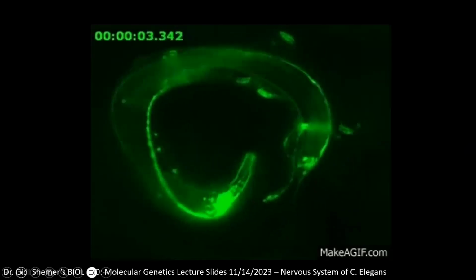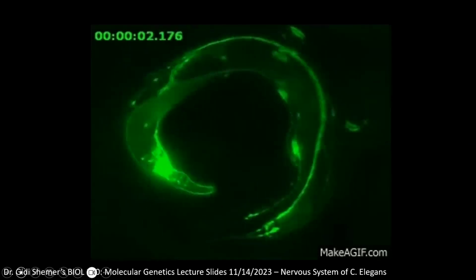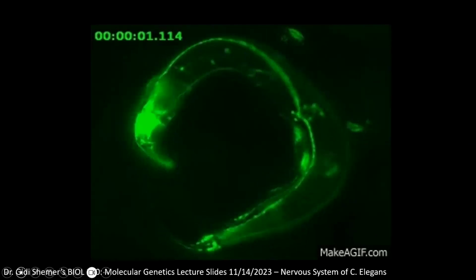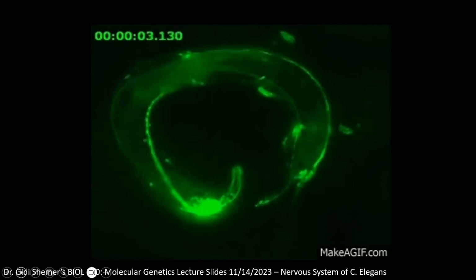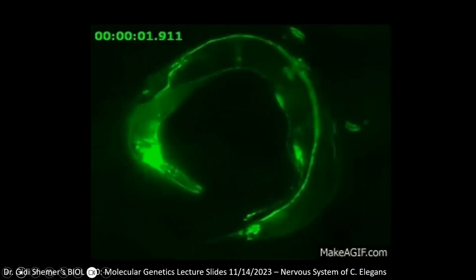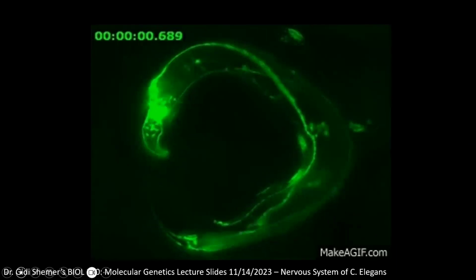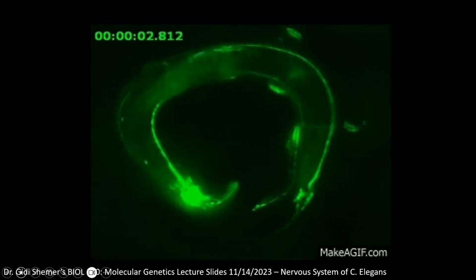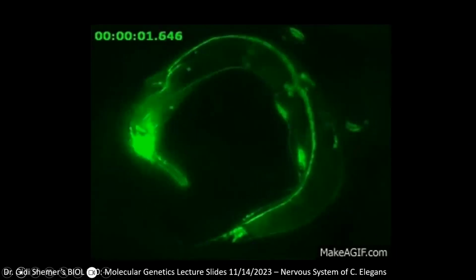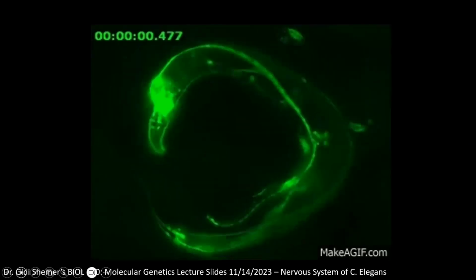While the word immunofluorescence may seem daunting at first, I want to remind you that it's actually pretty cool. Here is the result of an immunofluorescent assay in a model organism called C. elegans. And these biologists wanted to visualize a protein found in the worm's nervous system. So the nervous system is what's glowing in this picture. Now, let's learn how biologists are able to do this.